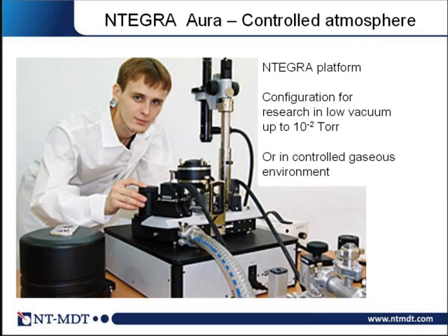So here is shown the device from NT-MDT, which allows you to create a low vacuum, which is enough to improve the Q factor of the cantilever and to improve the signal-to-noise ratio with respect to ambient conditions. Moreover, using additional gases, one can also create an environment which is important for different applications, for example, for biological or chemical applications, where you can use different gases.